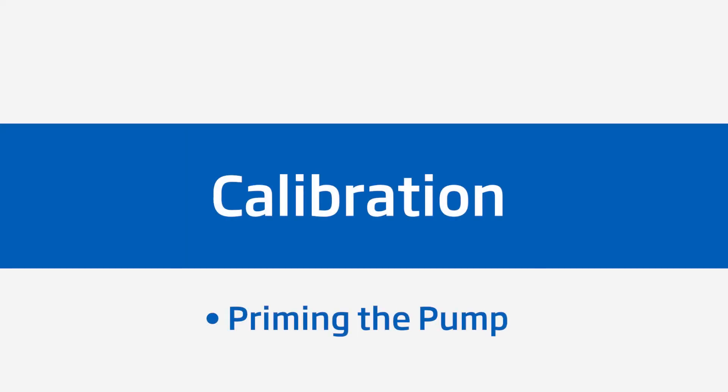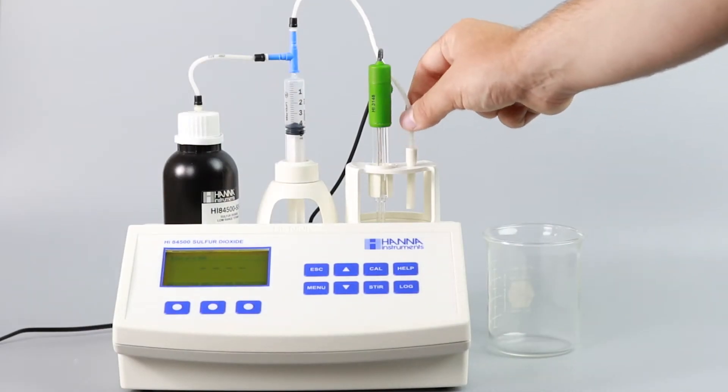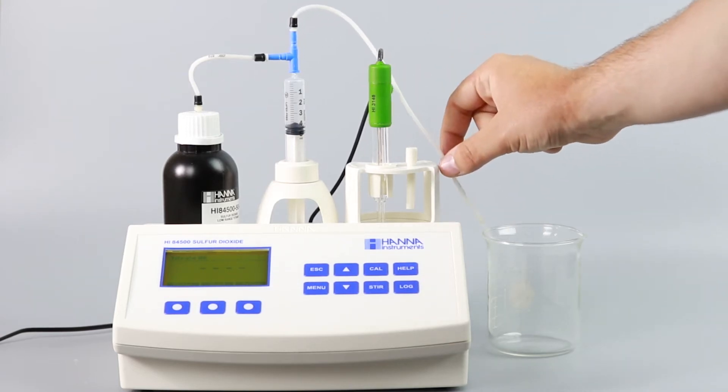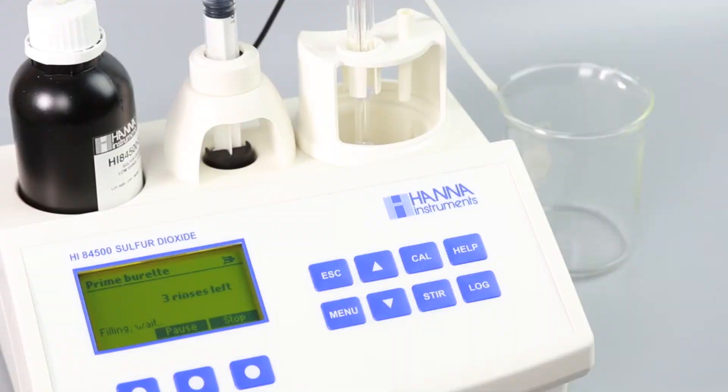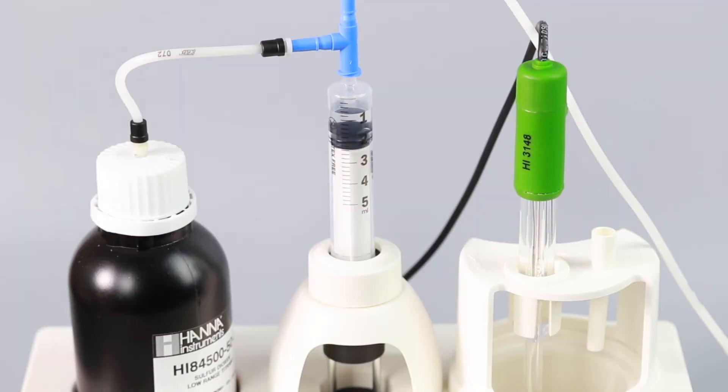First, you'll want to prime the pump to ensure that the tubing and syringe are completely full of titrant. To do this, place the dispensing tip over a separate rinse beaker to catch any excess titrant as it primes. Press the Prime button, then the Start button. The titrator will automatically complete three prime cycles.